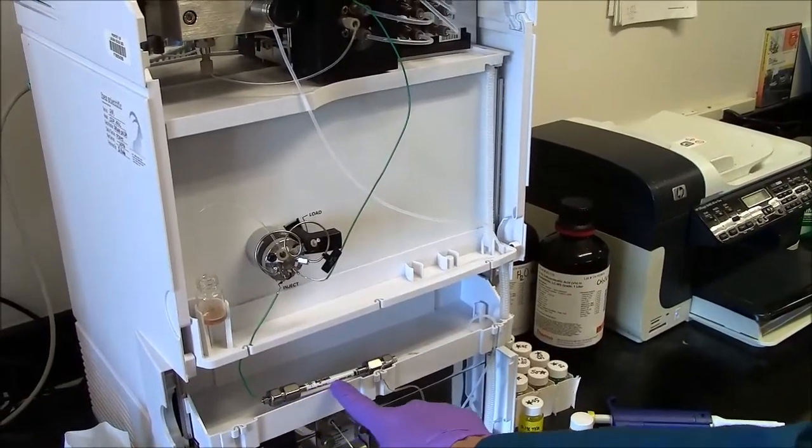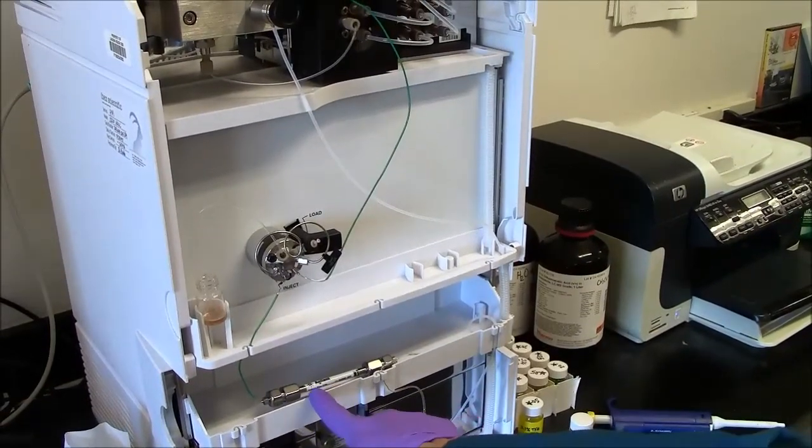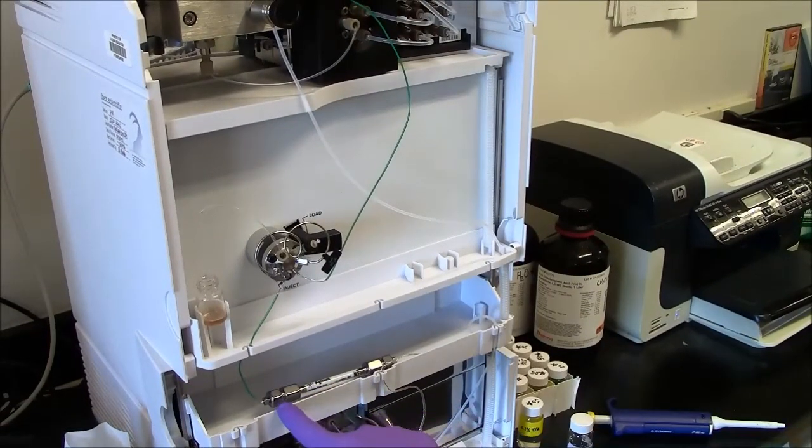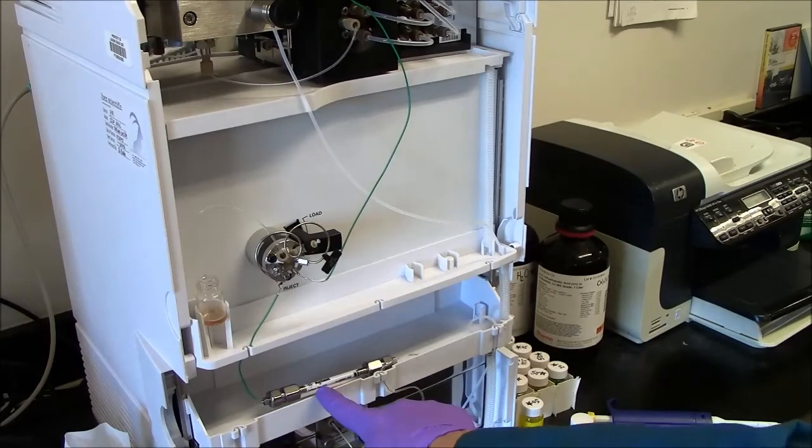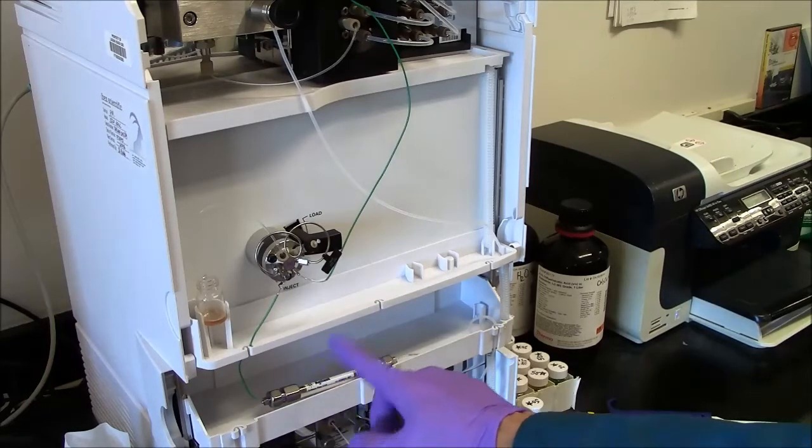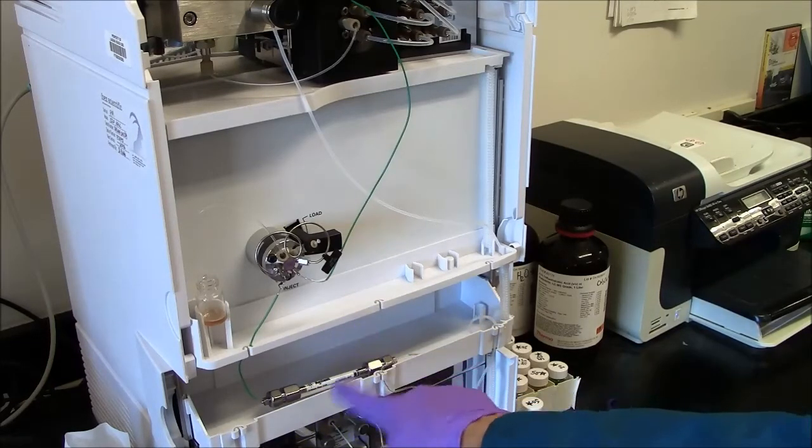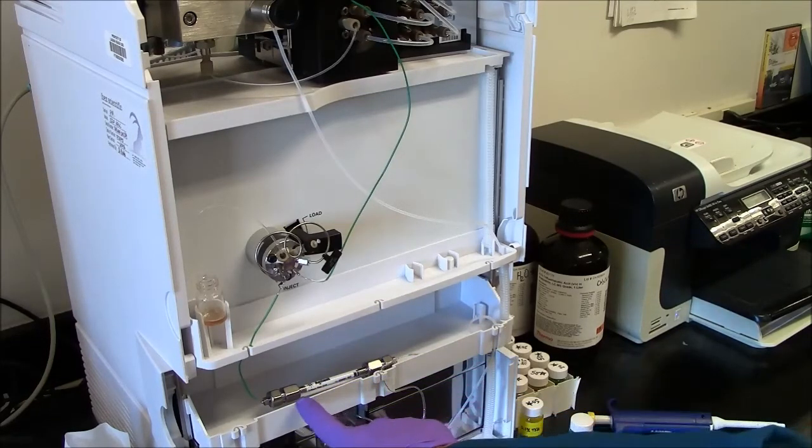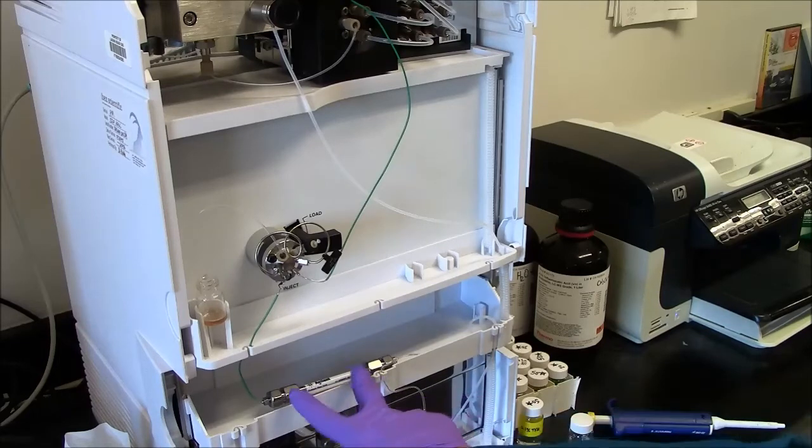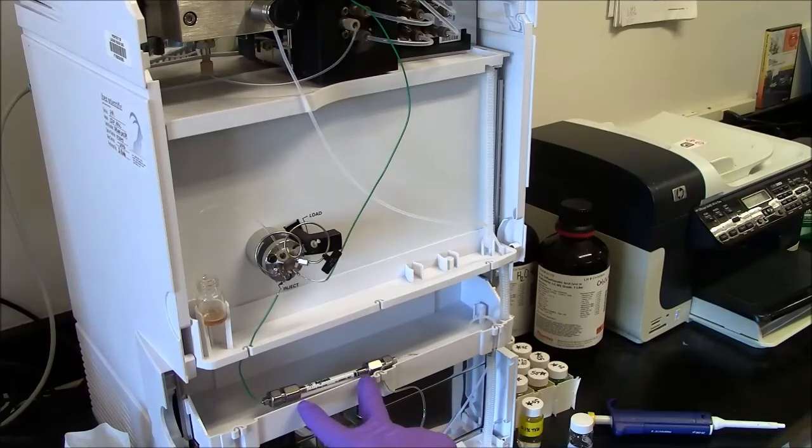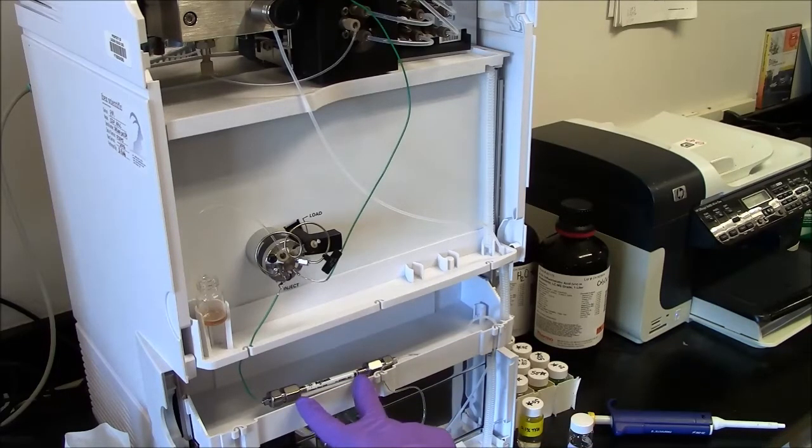This is called a C18 column. It's a hydrophobic column with 18 carbon groups hanging off the silica. This will retain molecules for different amounts of time.